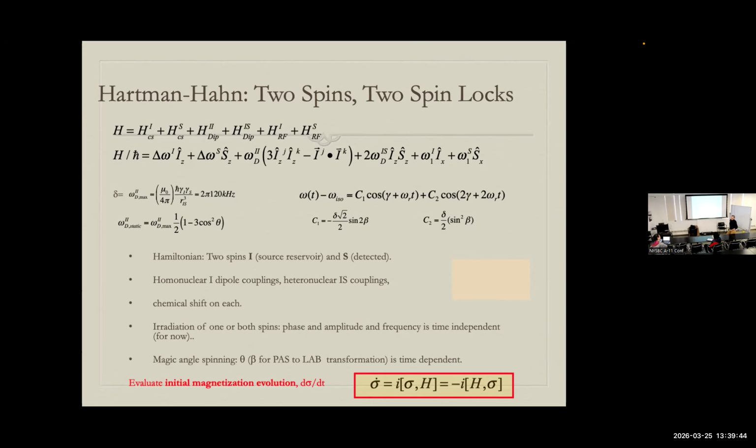If they're almost degenerate, they're on the same nucleus, and this coupling is so strong compared to the chemical shift difference. In old literature, we would call them AA prime spin systems instead of AX spin systems, right next to each other, so that their tails are even overlapping or worse. Then that secular approximation is over. Then transfer of energy between I1 and I2 is isoenergetic, and we should not be making that approximation.